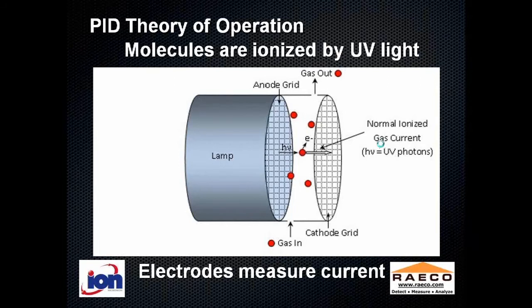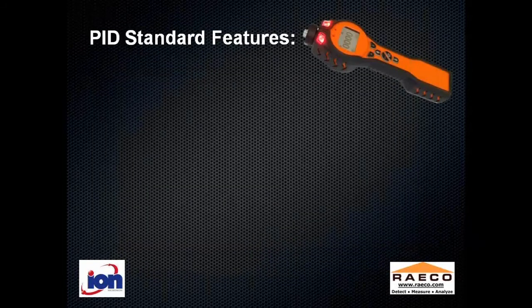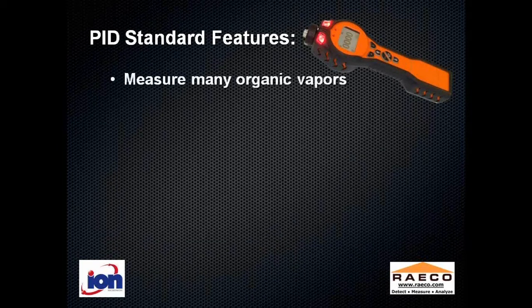All right. The standard features, and here we're talking about PIDs that are handheld and portable, not your fixed PIDs or laboratory equipment. These PIDs measure many organic vapors and some inorganics. The readout is continuous, with a response time typically on the order of a few seconds.